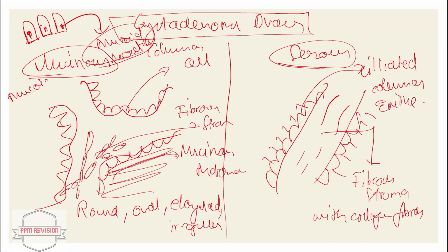Columnar cells are filled by mucoid secretion. Next, the honeycomb framework consists of cellular fibrous tissue in which a few vessels are seen. The septa in some places are reduced to thin partitions by dilation of the cystic spaces.